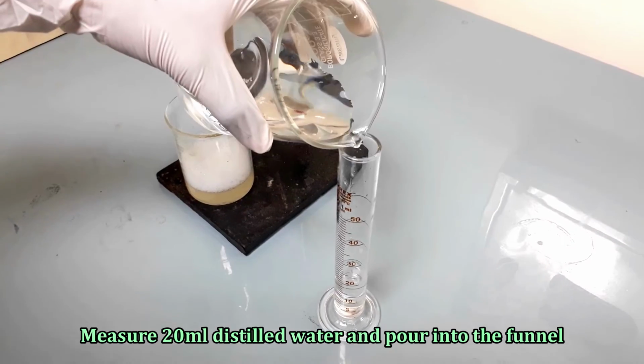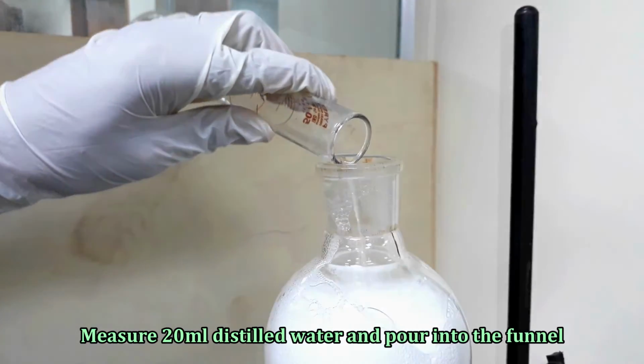Now wash the extracts with distilled water as done in washing 2.